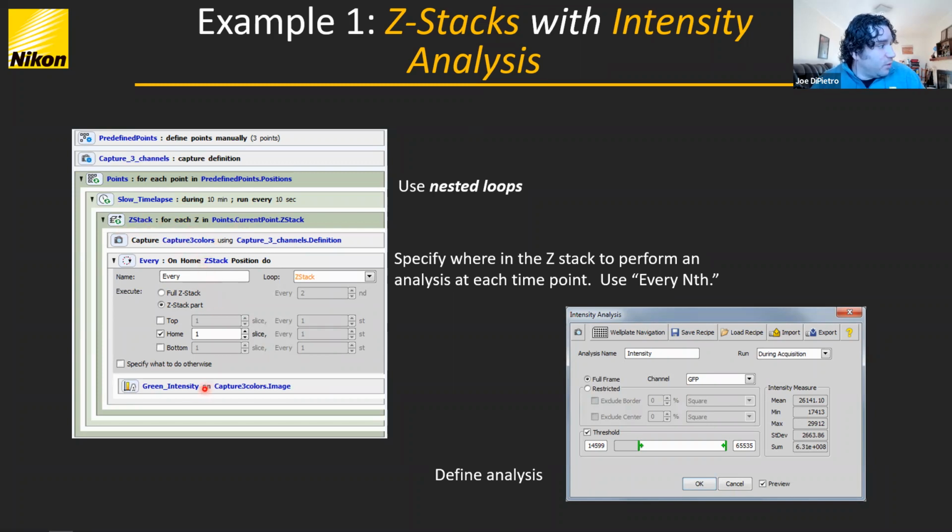And then when we're done with the Z-stack, we will measure the intensity of the green channel, and then put that into a chart. And then at the end, not only do we have the Z-stacks that we predefined earlier, we don't have to constantly stop and search for another one. We find them all. It does them. It does the time series.